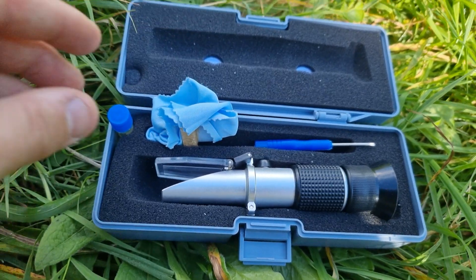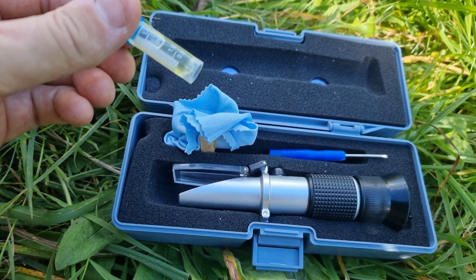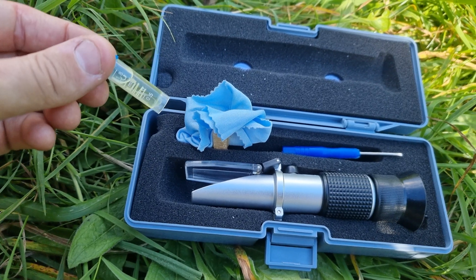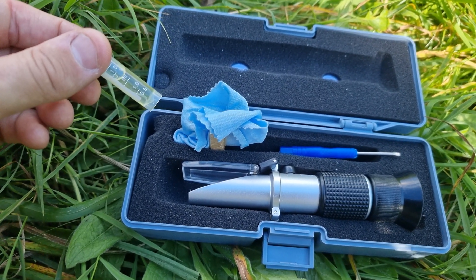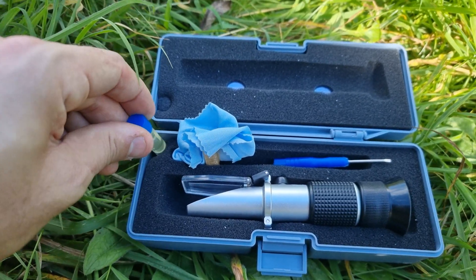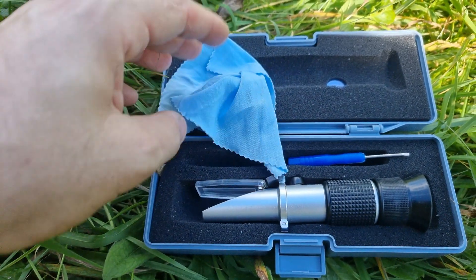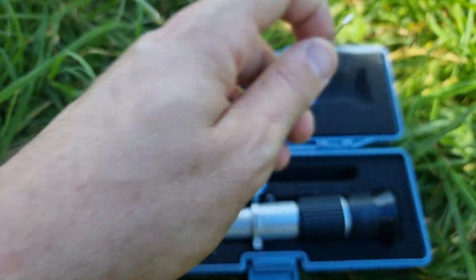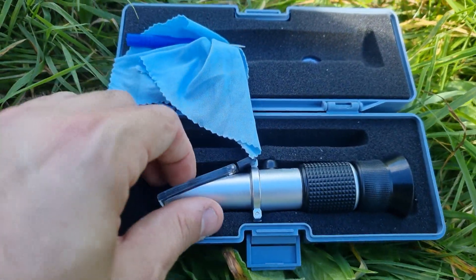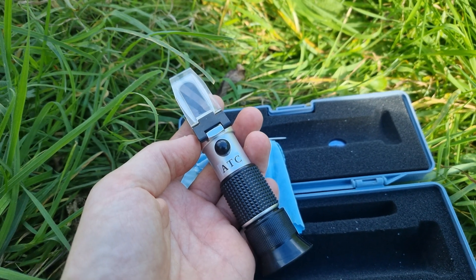When you open the box you get various little bits. The first thing you'll see is some calibration oil — whatever you do, don't lose your calibration oil. You'll need that when you come to recalibrate, which is good to do two or three times a year. I'll cover that in a separate video, but keep that little vial safe. You also get a nifty little cleaning towel and a small screwdriver.